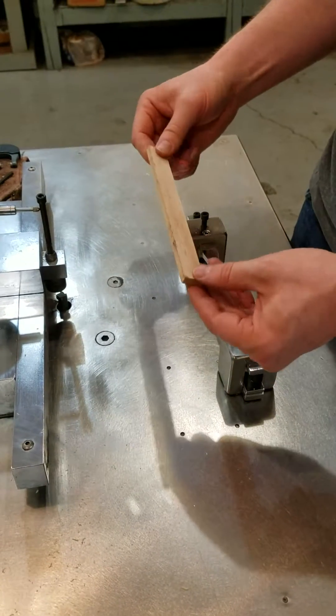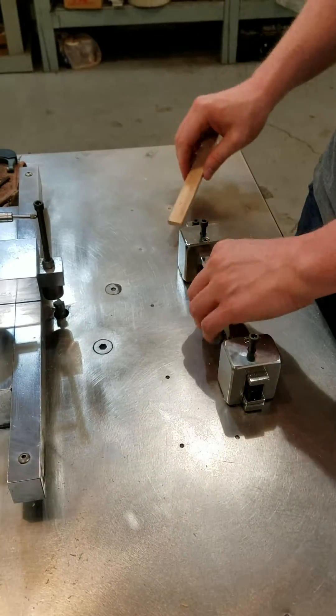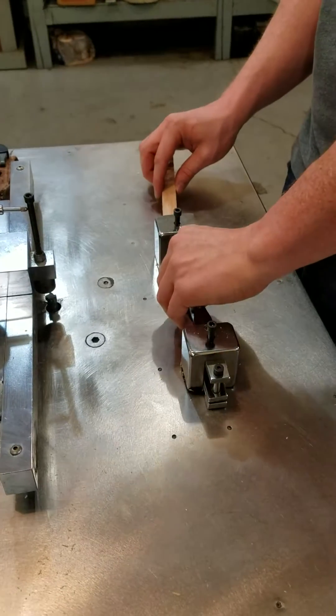First, you've got to get your strip down to 750 thousandths wide, and then it will go right into one of our standard templates.